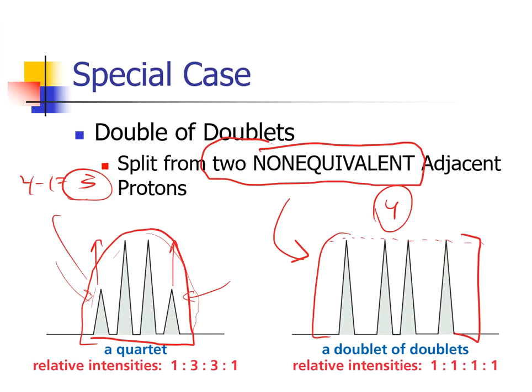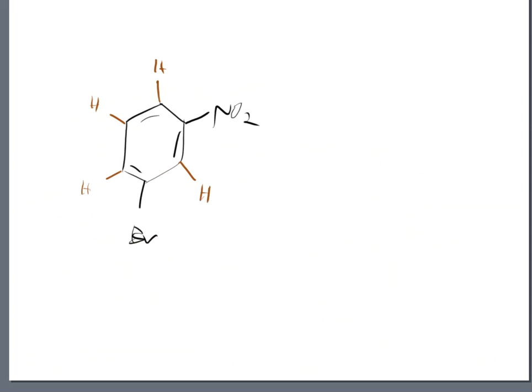All right, so we're going to ding-dong the molecule, and when we do that, well, let's take a look. I keep clicking on the slide instead of the actual draw pad. All right, so here we're going to ding dong. There's going to be a chemical shift because that proton is in between an NO2 and a Br, right? Okay, so if we move down and around like a clock, this is also going to be a ding dong because that one's next to a bromine, but it's not directly next to an NO2 group that has a carbon on it, right? So because of that, that is a different proton, and it's a different carbon, and it's a different chemical shift. And then we move on up, and that's going to be ding dong.